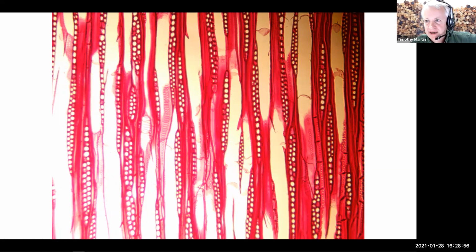I want you to take the images that we've provided to you, provide an example of each of those as a figure, give a good caption for the figure in your lab report, and label, where possible, tracheids, vessel elements, fibers, rays, early wood, and late wood in those different views in each of those figures.